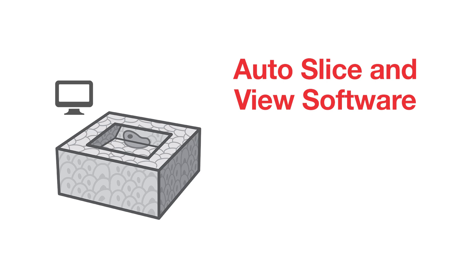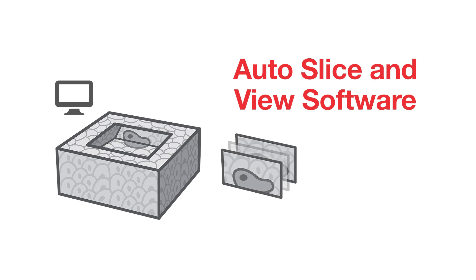With Auto-Slice and View software, automated data collection can be managed over large areas or precise cellular volumes in preparation for 3D reconstructions.